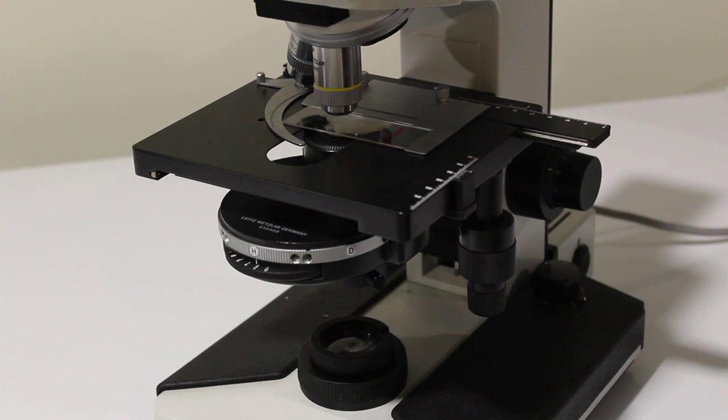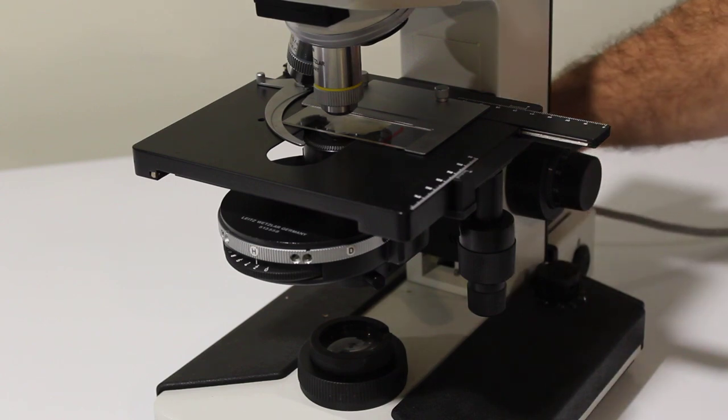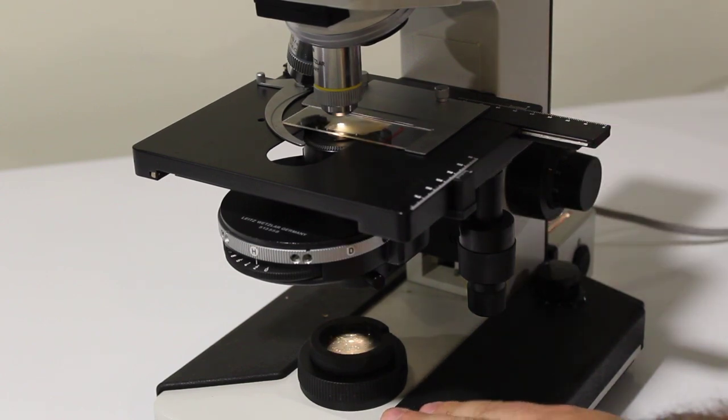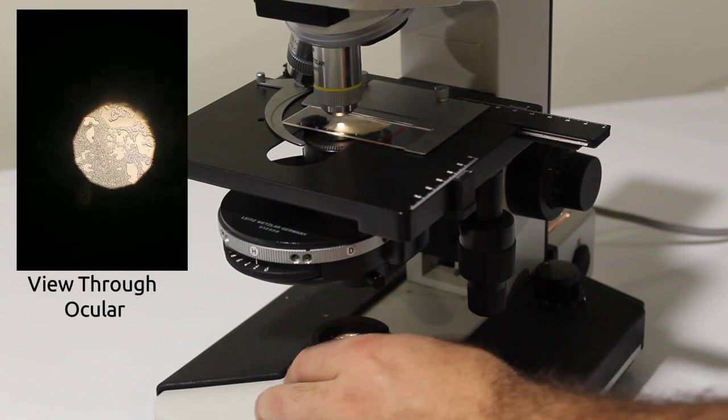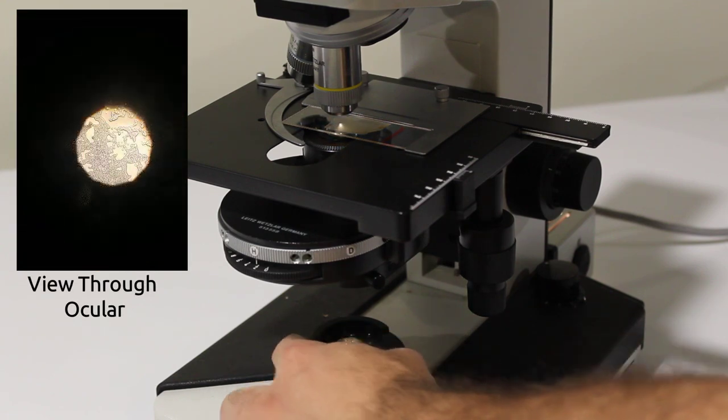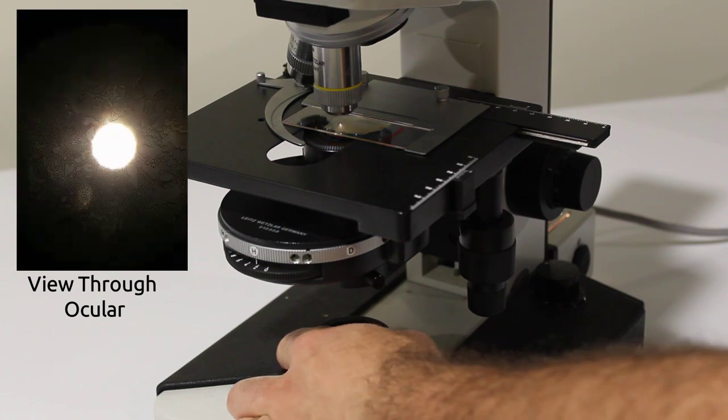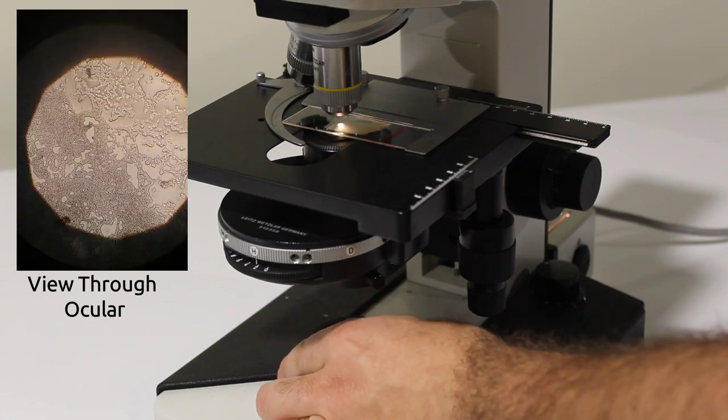The first component of your microscope's optics is the illumination source which is located here at the base of the scope. Now these come in two general styles: there are fixed illumination sources or there are what I have here which is an illumination source with a diaphragm that can open and close to control the brightness of your sample and to control the focus of the light on your sample.